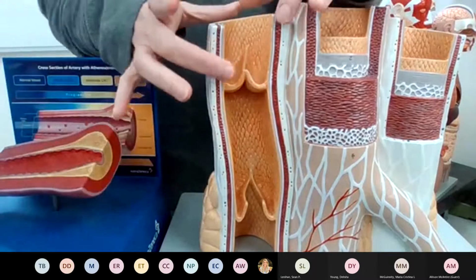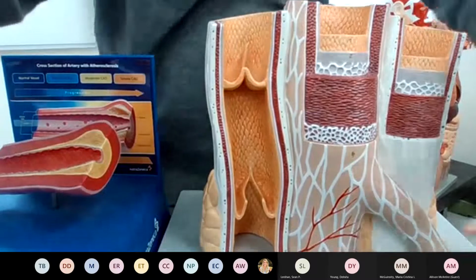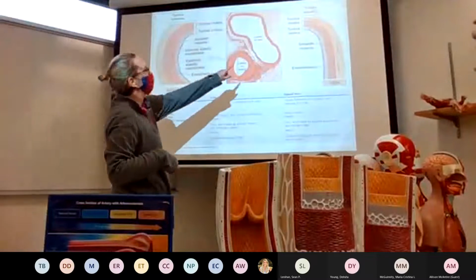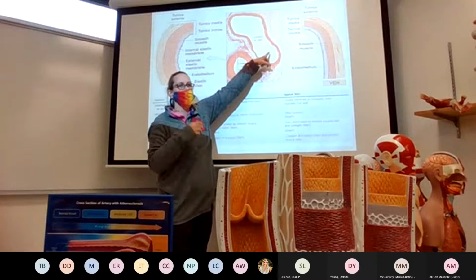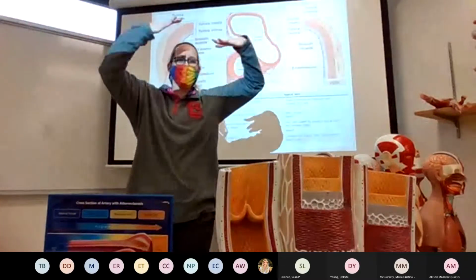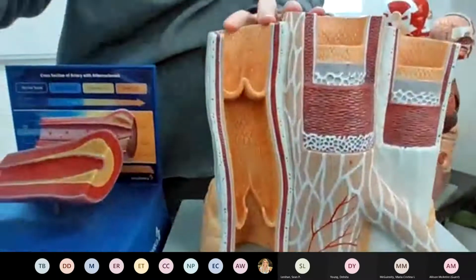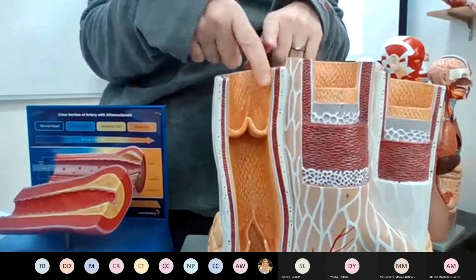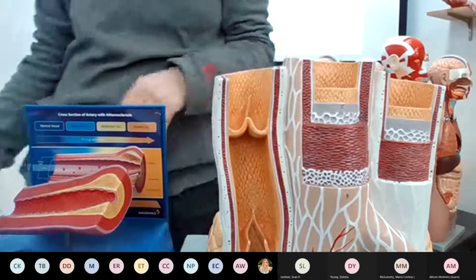But in our veins, where there's less muscle and less oomph, and again, it's in the slide here if you can see it, veins are going to be these crazy oval, long shapes, because they take a shape based upon the forces and pressures around them. So the tunica intima may look like a nice circle in an artery on the inside, and in a vein, it's just going to be that lining with this oblong, long, crazy look.